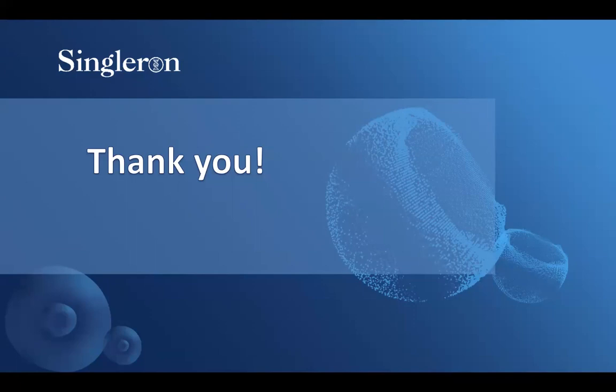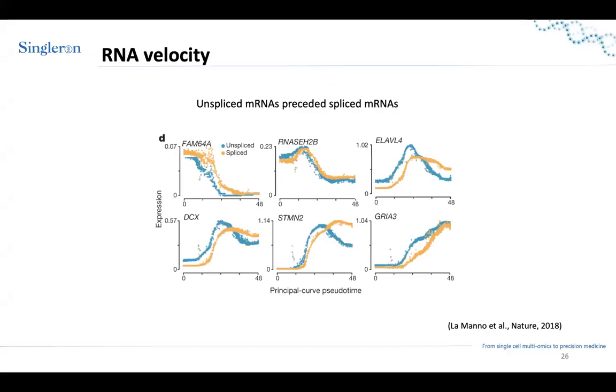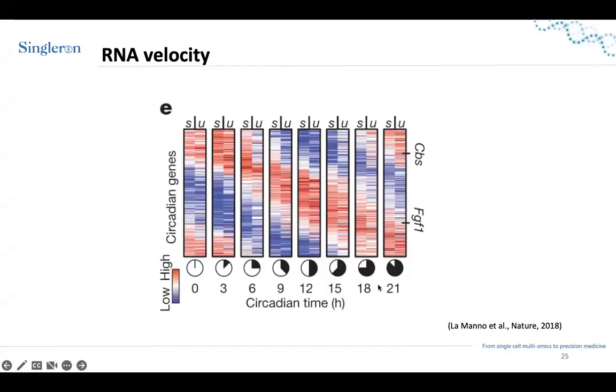The next question from the audience is also related to the trajectory analysis. When we have in the pseudotime the hours, for instance 18 and 21 hours, is this a pseudotime, or is it longitudinal, related to different collection points from longitudinal studies, which were collected at different intervals from the patients? Could you explain that, please?